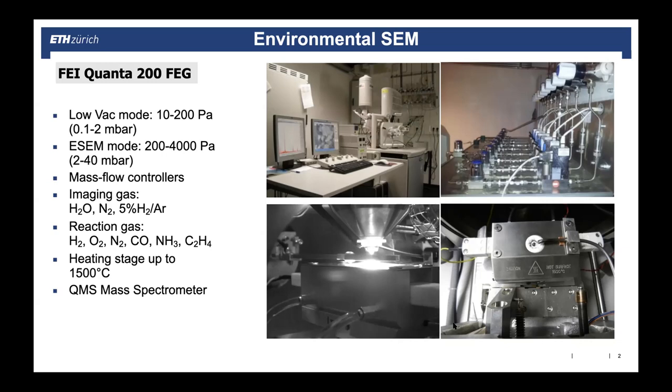Okay, anyhow, so this is the instrument that we use, and it's really cool because it can be operated, first of all, of course, in high vacuum mode, but then you can introduce gases into different operating modes where the pumping system is slightly differently configured. And you can work in a quite large range of pressures. In a collaboration with a group from Graz, we were actually even once doing an experiment at 1 bar. So you can really go up to very high pressures inside that microscope and still get some images. And yeah, so this is the instrument that we have used.